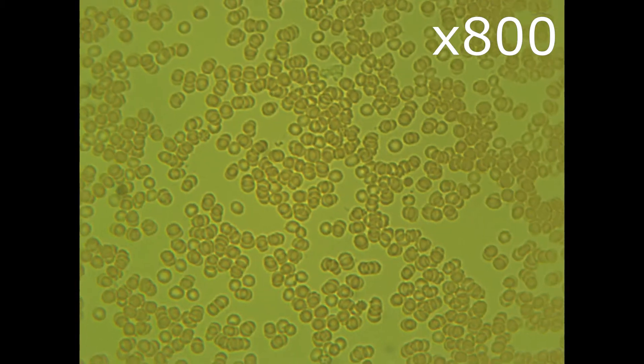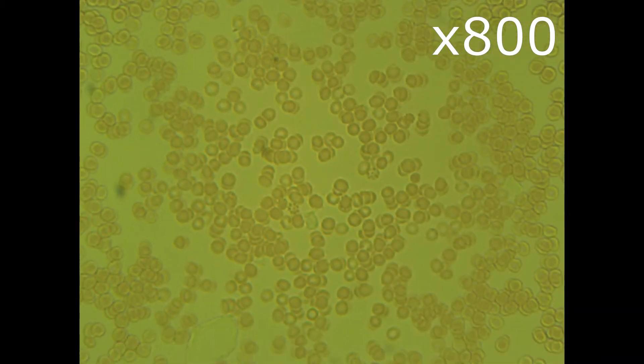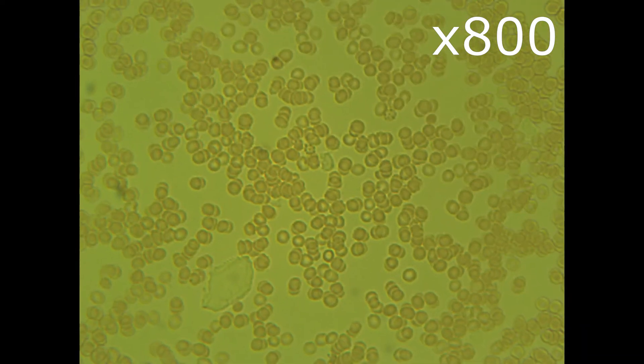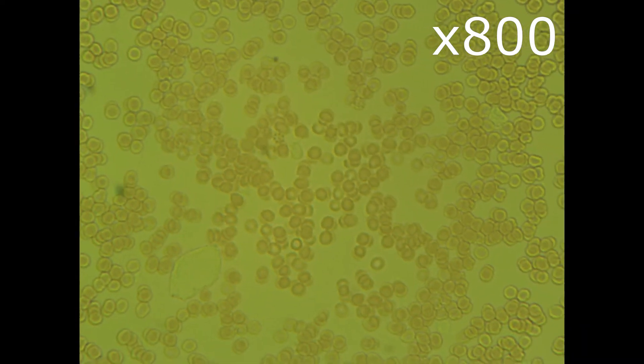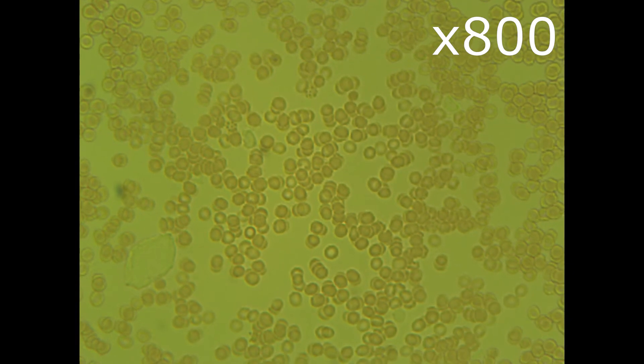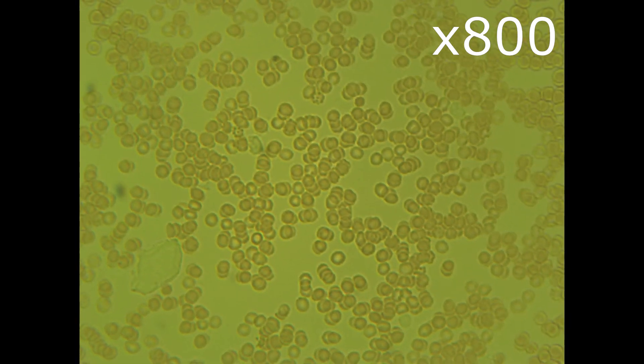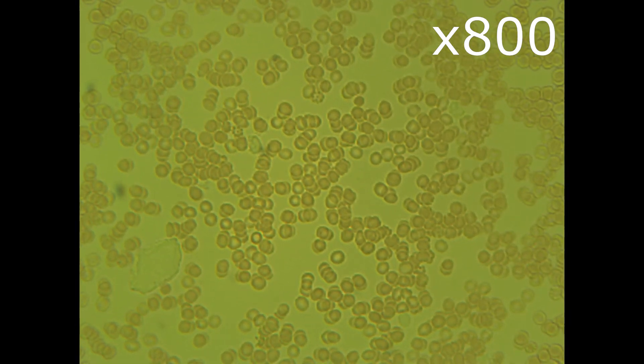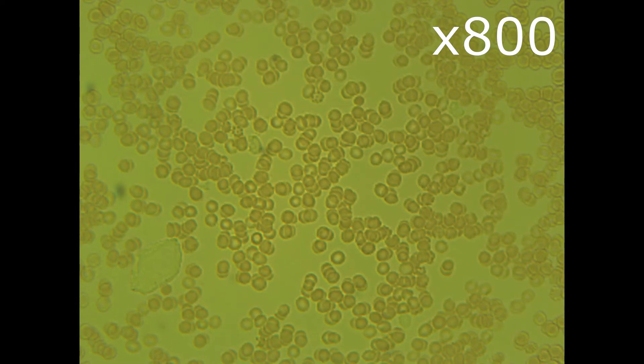Here is 800 zoomed. I still can see individual red blood cells. I am here covering a larger area, just to show the blood condition. In my previous videos, I showed you how an echinocyte looks like. Can you spot it in this view?